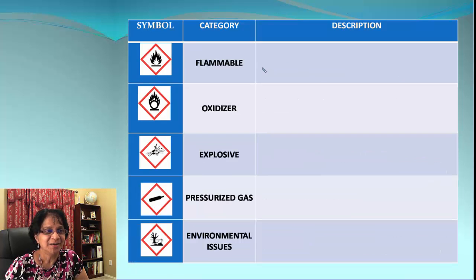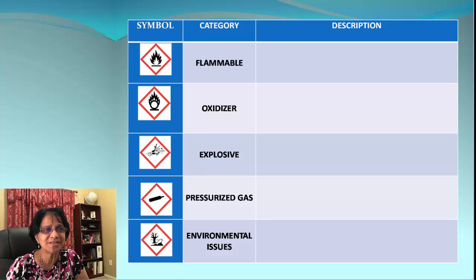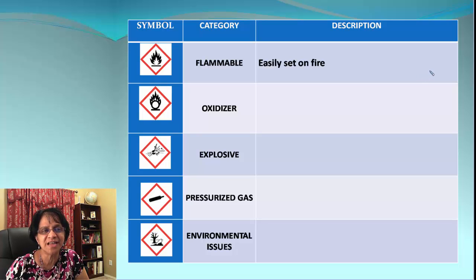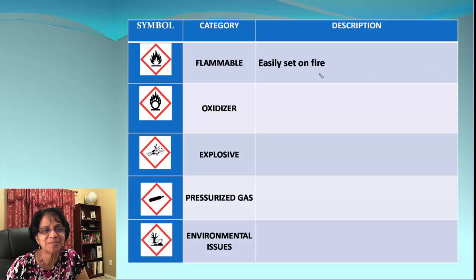Moving on. Look at the GHS symbol — very clear, that's a flame. That's called a flammable substance, meaning it can easily catch fire. So the bottom line is you're not going to keep a flammable substance close to a Bunsen burner or a hot plate.